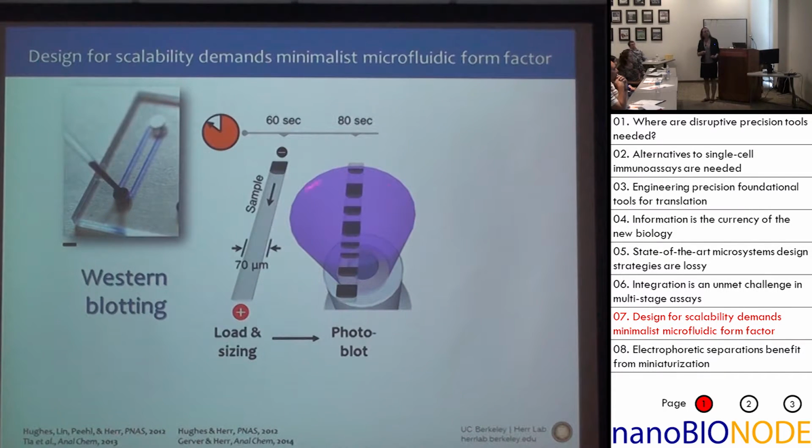And then with a brief exposure of that channel to UV light, so a couple of seconds to tens of seconds, we basically abstract hydrogen from any CH bond that's present in our sample, immobilizing protein now on the gel. Okay, so there's no manual blotting step. The proteins are locked in place in the gel using light. Okay, so it's a light-active polymer. A key thing to note about that is a covalent bond that forms. It is not a hydrophobic interaction, as I compared to with the conventional approach.